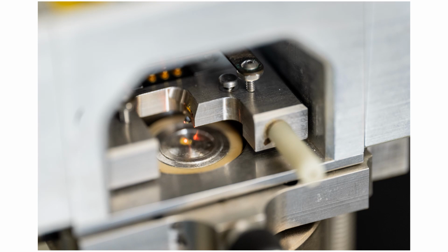My name is Richard Seabreeze, and today we'll be talking about atomic force microscopes, or AFM. AFM allows you to image the surface of samples. You can zoom in much closer than you can optically, so you can go beyond the optical limit of light.